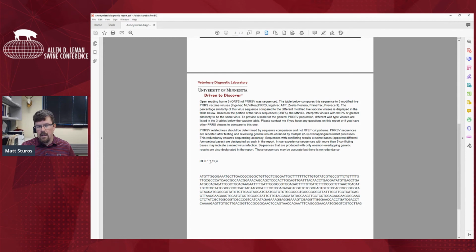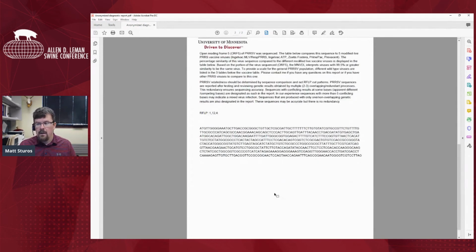For sequences done here, you just need to contact us, and we can set up charts for you based on the sequences you've had done at the diagnostic lab. We can also do analysis on other sequences from elsewhere. There is a small fee associated with that, so we can maintain your client chart with external sequences. I'm hoping here you'll feel comfortable being able to do some analysis yourself.